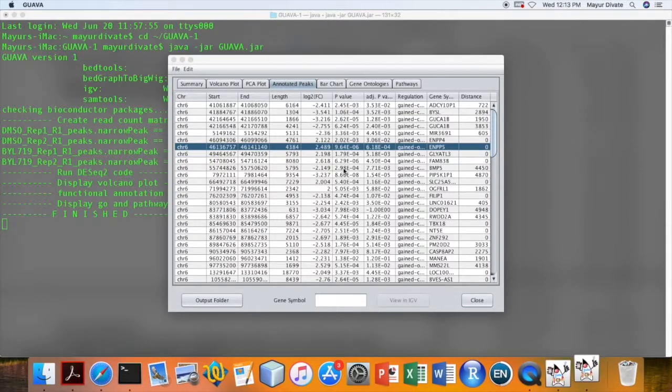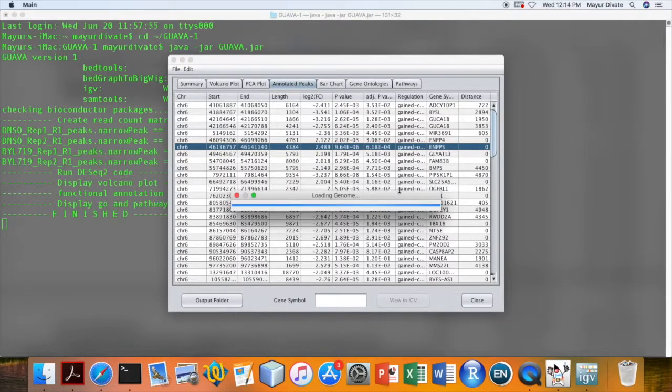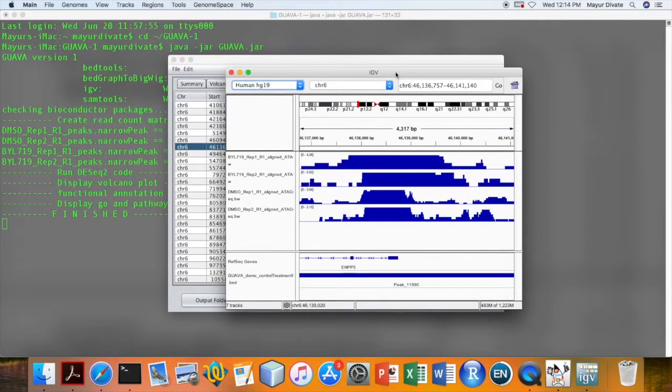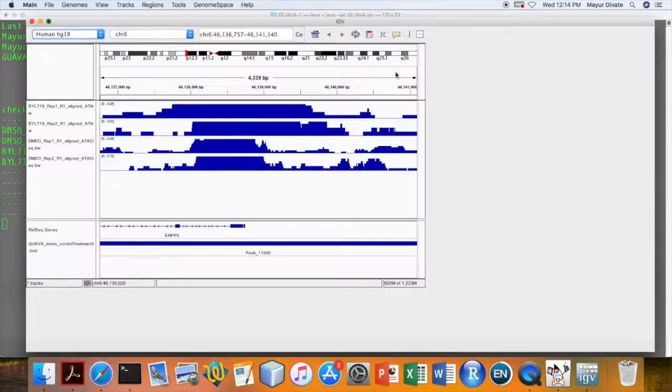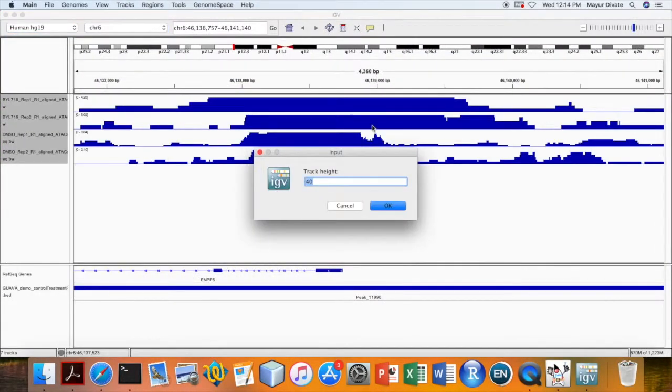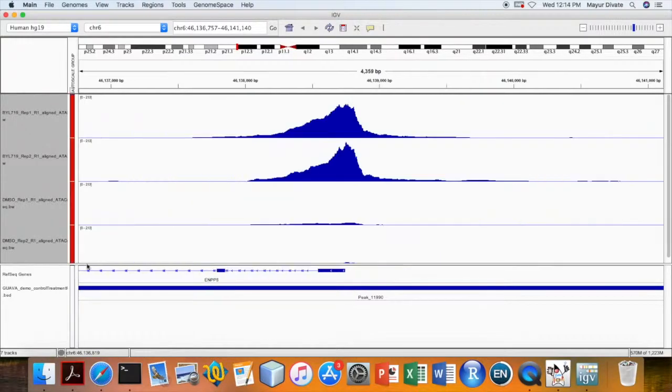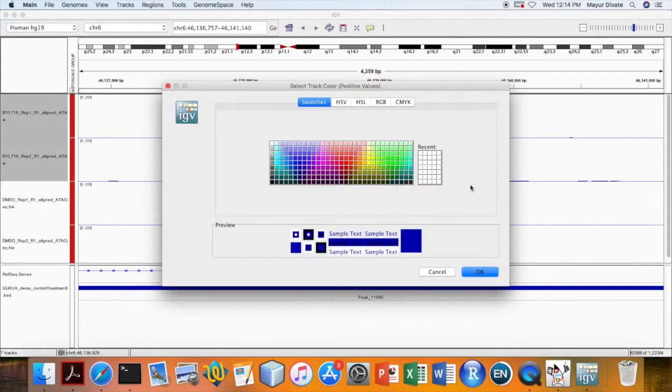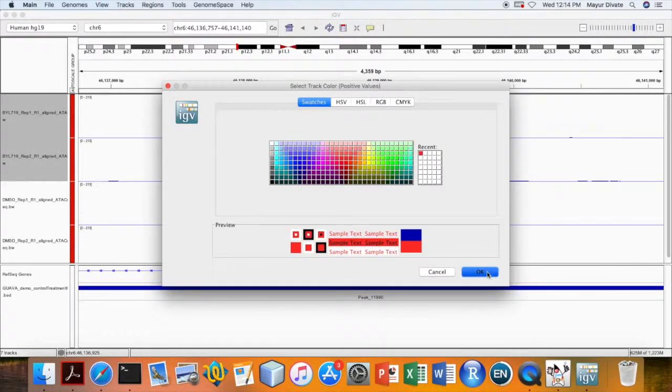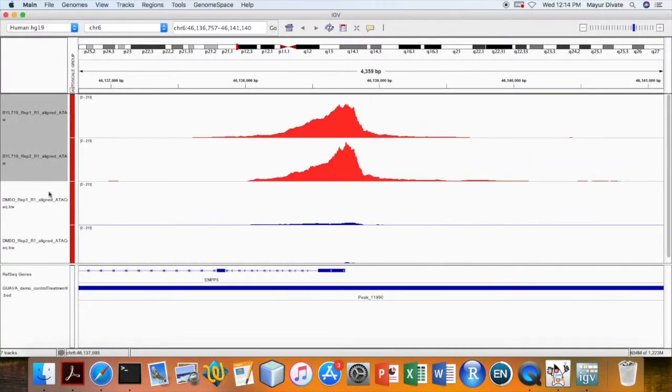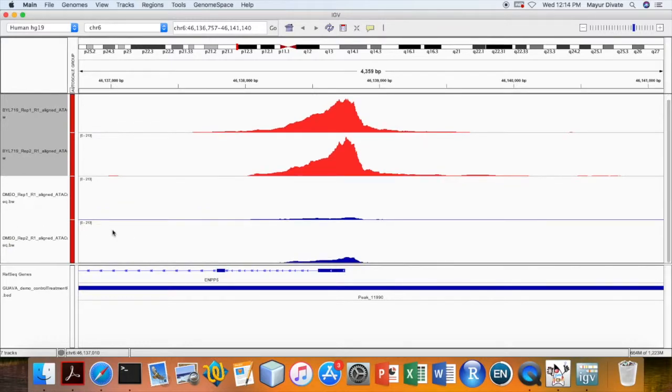This will open the IGV and automatically it will load the tracks to IGV. Then set the IGV height to 100 and change it to group scale. Plus you can change the colors of control and treatment samples. Here I change to red.